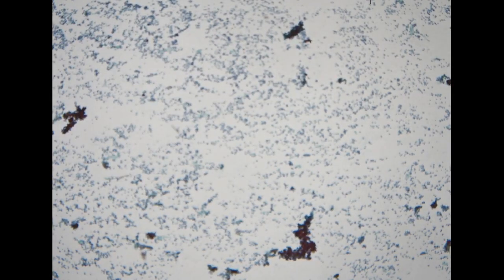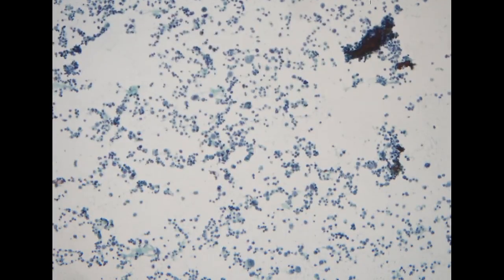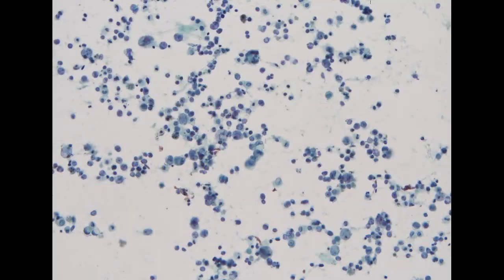The first specimen is an ascites specimen from a 65-year-old male. He has been diagnosed with pancreas adenocarcinoma last year, and he was under treatment but developed massive ascites recently. So this is a cytospin preparation.